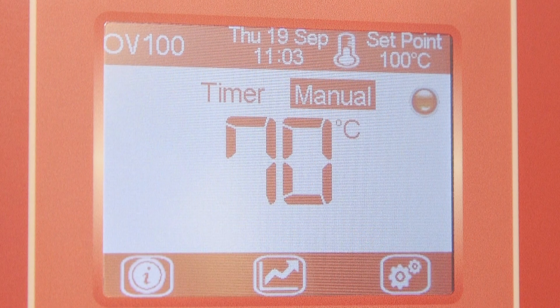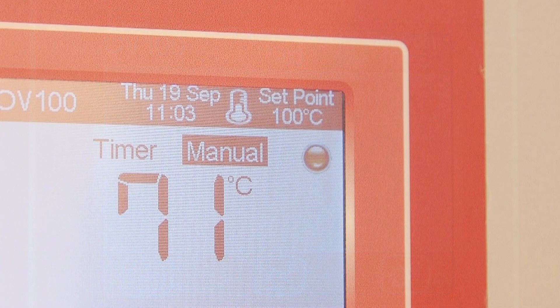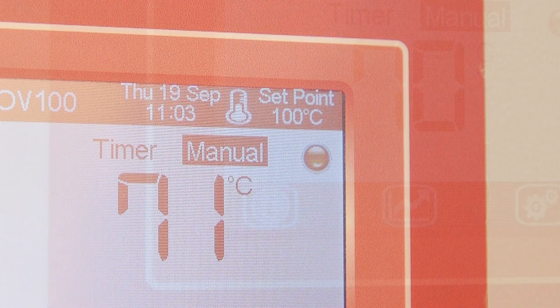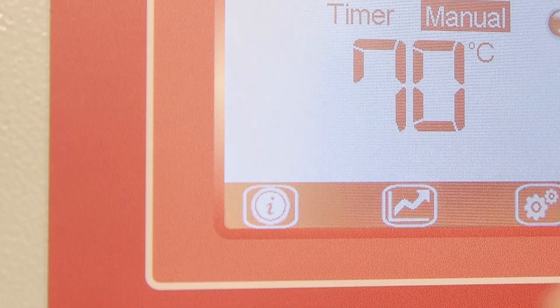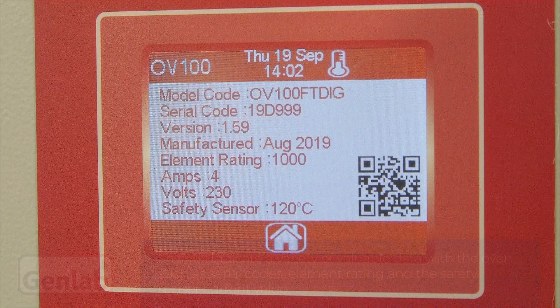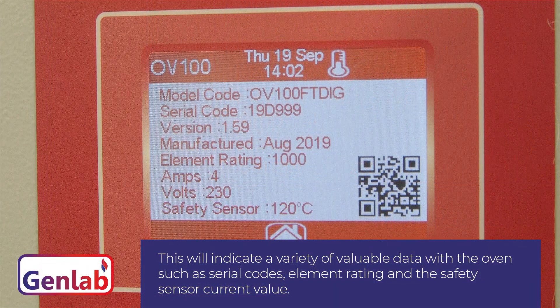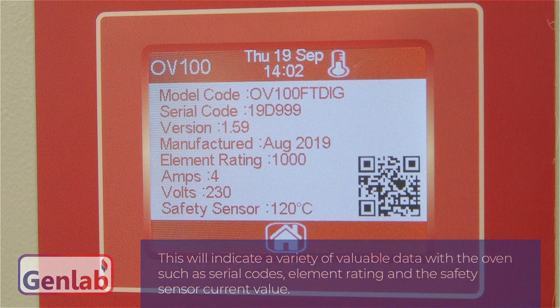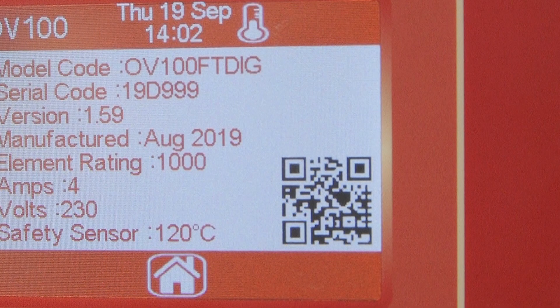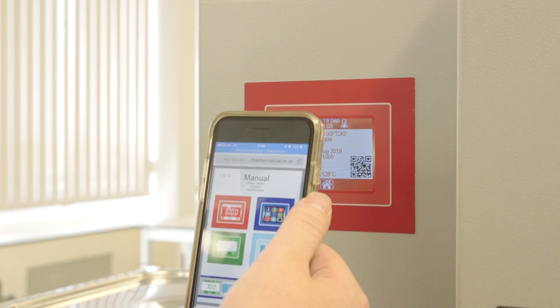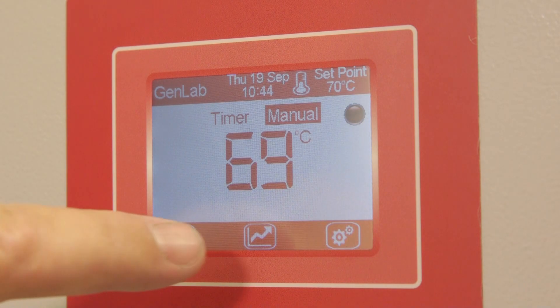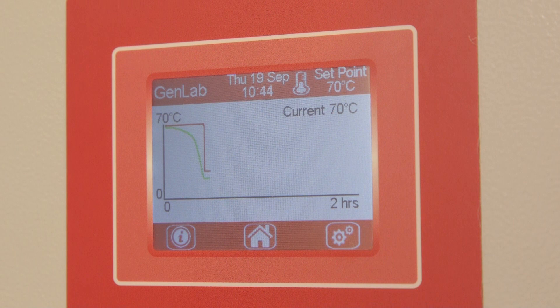The large temperature display shows the current chamber temperature. The chamber will now start to rise or fall to control to the new set point. Along the lower section of the home page is the information screen. This will indicate a variety of valuable data about the oven, such as serial codes, element rating and the safety sensor current value. On this screen is a QR code where you can download a full product manual. The next icon is the trend page; further information on the trend page is highlighted in chapter 10.